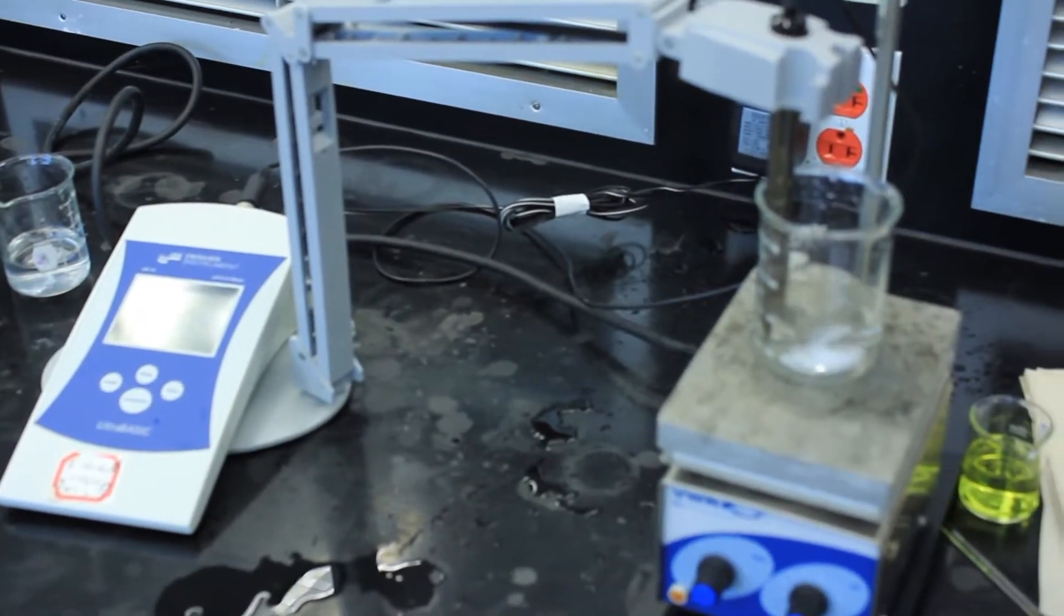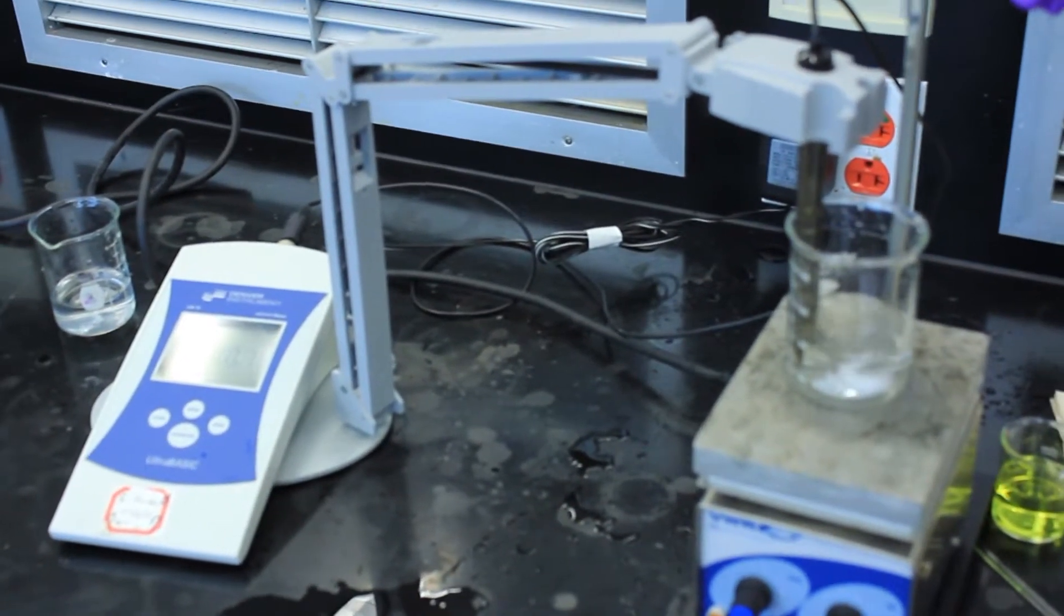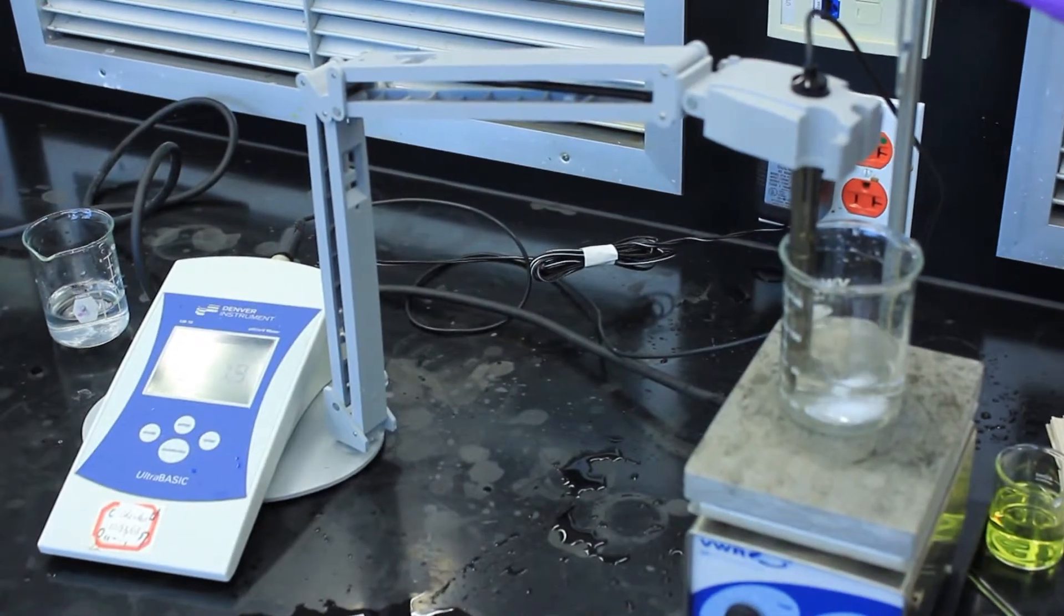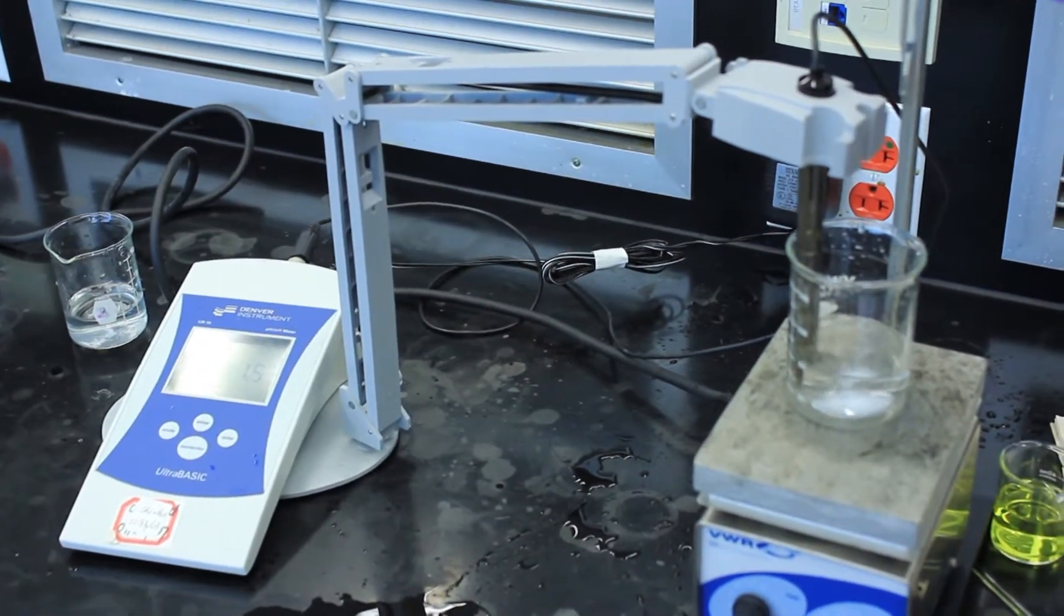Once you've approached your equivalence point, you can go ahead and shoot past it. You can start adding 2 milliliter aliquots again. Your pH will rise sharply and become very basic.